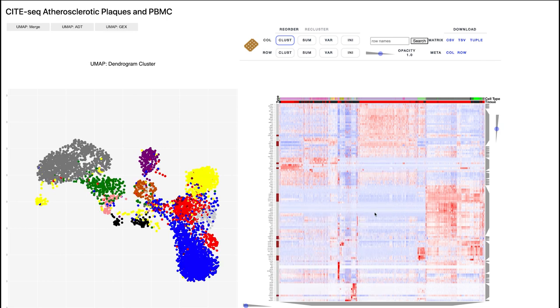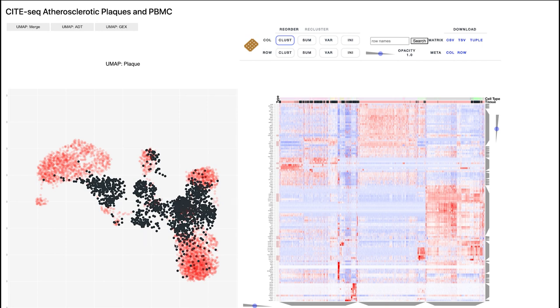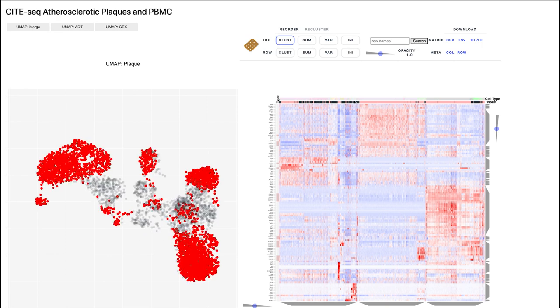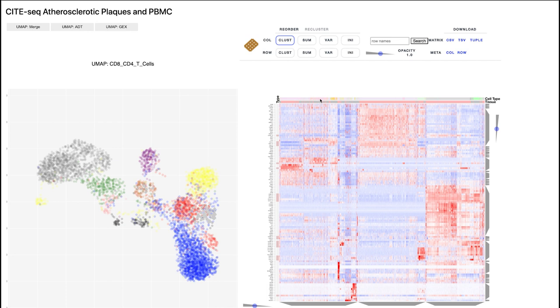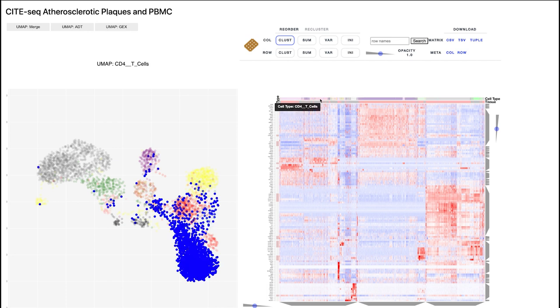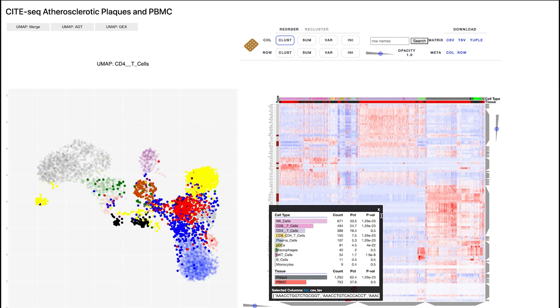One of the other key components to our data visualization approach is that we really want to integrate data-driven clustering — the actual structures you're finding in this heatmap — with our prior knowledge or labeling. This data actually consists of cells from PBMCs (blood) and also cells from atherosclerotic plaques. We've added those labels to the dataset. If you click here, you can see where those cells fall on the map. We've also assigned a cell type prediction, so you can click and see where cells of a particular cell type are located. We're able to layer on multiple levels of metadata on each cell and see the relationship between unbiased clustering and the breakdown of different categories, which helps us interpret what's happening in our data.